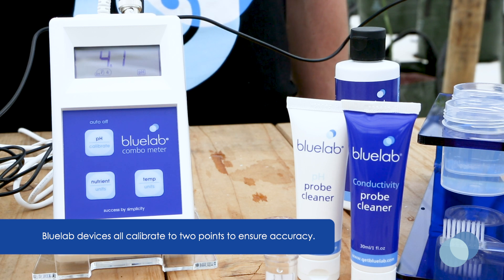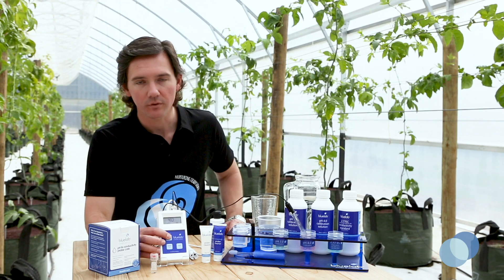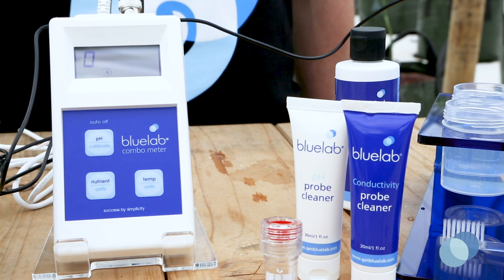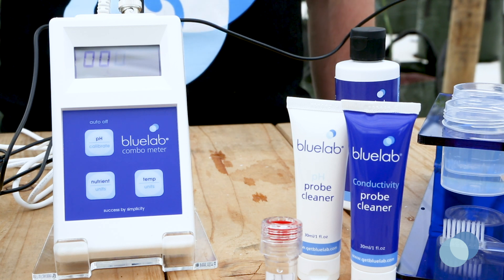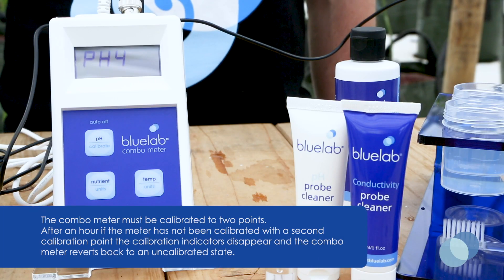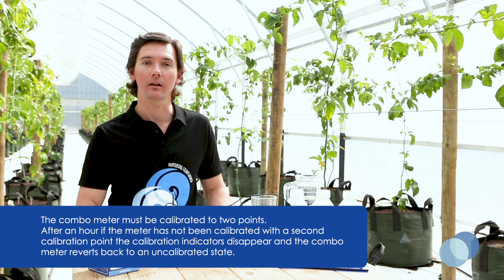Wait for the reading to stabilize on the combo meter. Press and hold the calibrate button until CAL displays on the combo meter screen, and then release your finger. You'll see a series of flashing symbols again letting you know the pH 4 calibration is taking place. When calibration is complete, you'll see the pH 4 calibration indicator appear on the display. The calibration indicators will be on the display until it's time to calibrate again.